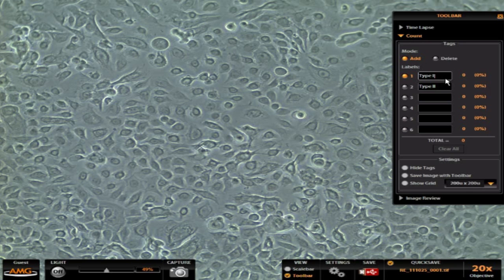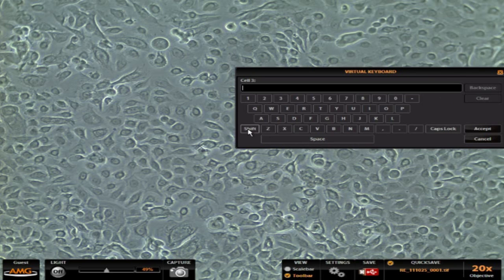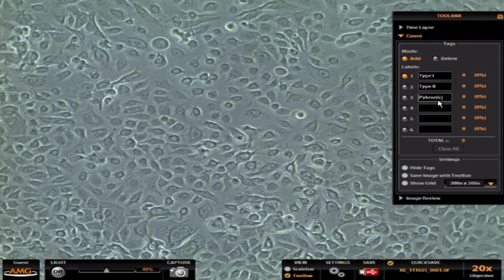If I want to create any other types, I can click in the text box here and type those in with a virtual keyboard, such as going in here and creating pyknotic cells. Say accept and now I've got that category created.